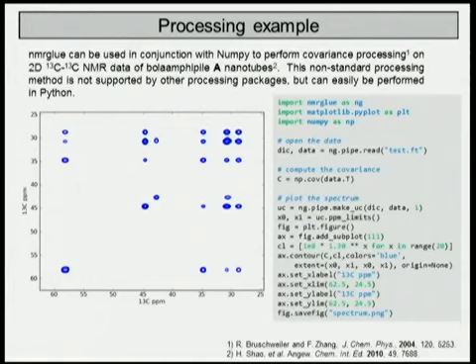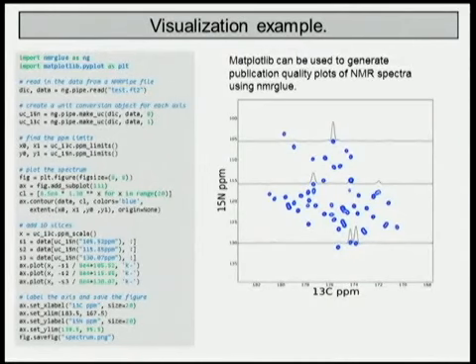So we can make some more complicated plots. These are very nice if you want to put them in a paper. I really like them because when my advisor comes and says, I don't like blue, I want them in red, I can go and edit my script and change a color and not have to redo everything by hand. In this plot, we're adding these little strips so that readers can get some information on our signal to noise.